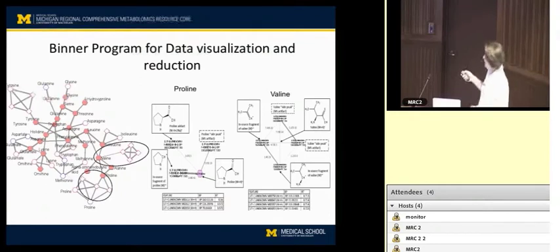or neutral loss events. So in mass spectrometers, things can fragment in the source before they get into the mass spectrometer. It's kind of like you're getting a pseudo MS spectrum. Your main peak of interest is falling apart in the source before it even gets into the instrument. It has exactly the same chromatographic time because it was a single compound coming down the HPLC column, but when it got to the source, just before being detected, it started to fall apart. And so there are a lot of what are called neutral loss events.